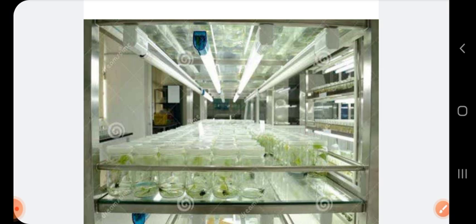Also, as they are plants, they need a normal photoperiod also. So a 16 hours light period and 8 hours dark period is required, and that is maintained in this culture room. That's why we use light sources here also. You can see tube lights are there. You can also use other sources of light as well, but it has to be a capacity of 3000 lux luminous capacity, not more than that. You cannot use halogen light or such warmer sources of light.